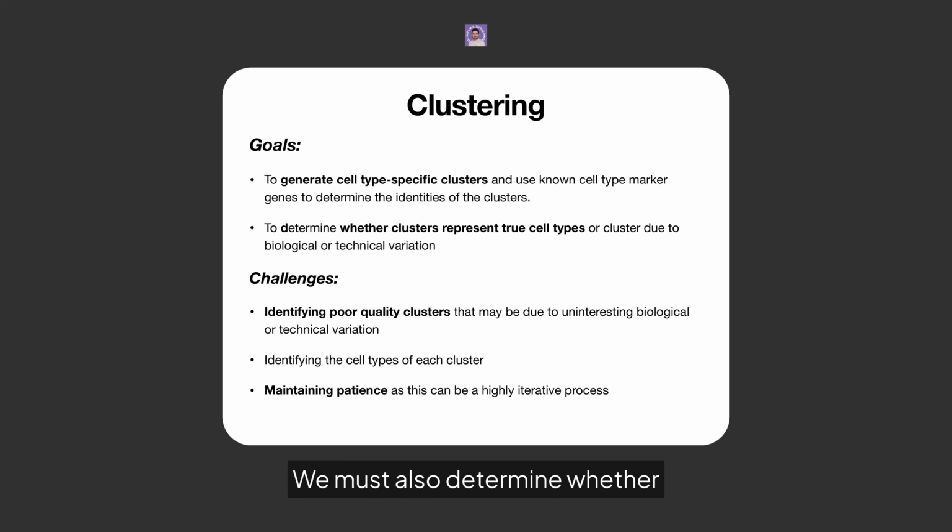We must also determine whether clusters reflect real cell types or technical artifacts. Challenges include recognizing low-quality clusters and iteratively refining cluster resolution.